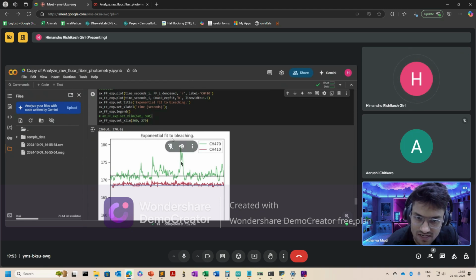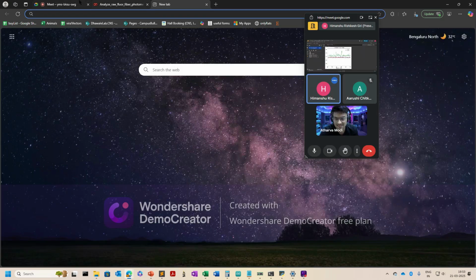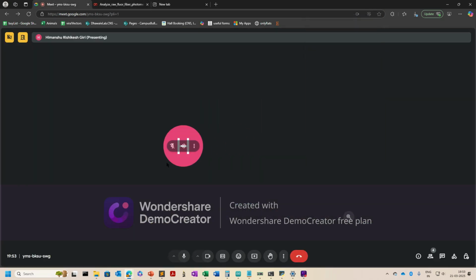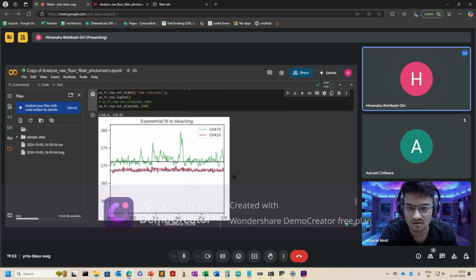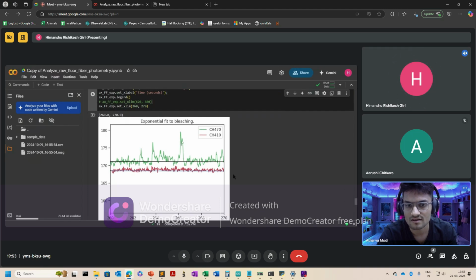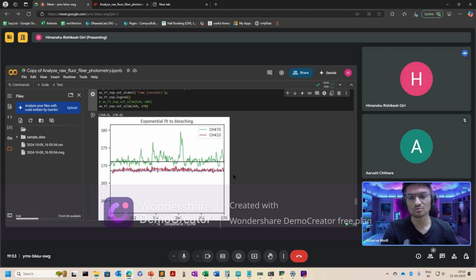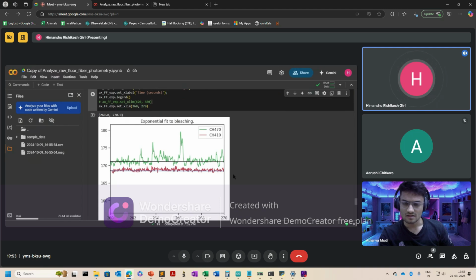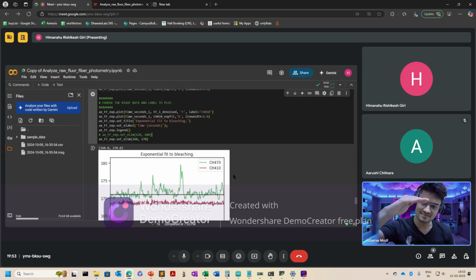So the percentage that you get is generally 2 to 4% for peaks. Generally this is the scale that we get, 2 to 4% or something like that. This is the maximum you can get. Now if your mean itself goes from 171 to 165, that itself is 3-4%. So you can't compare the signal directly; you have to scale it down.